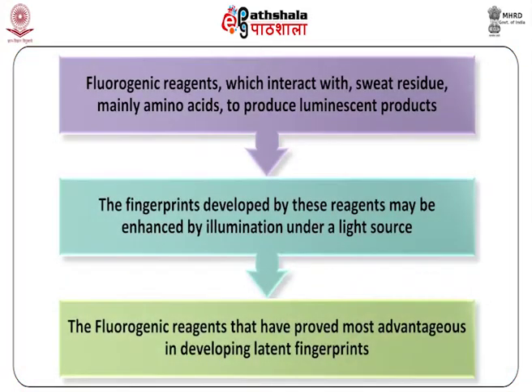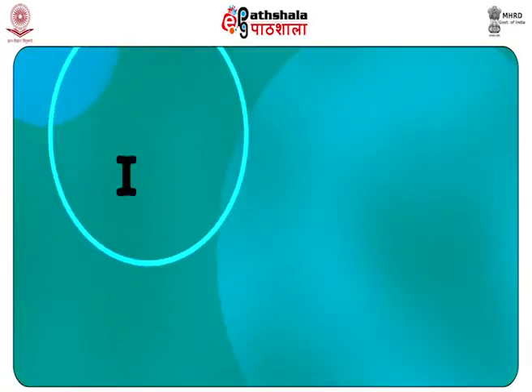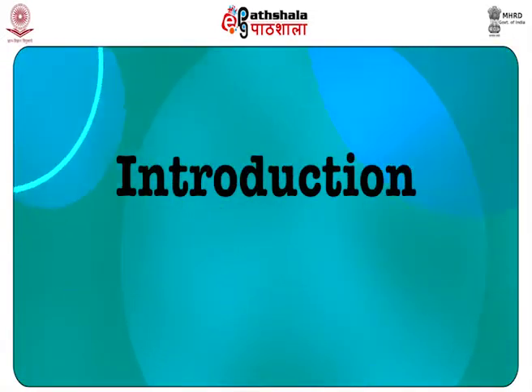Dear students, after learning this module, you shall be able to know about fluorogenic reagents which interact with sweat residue, mainly amino acids, to produce luminescent products. Then you'll learn that the fingerprint developed by these reagents may be enhanced by illumination under a light source. And finally, you'll come to know the fluorogenic reagents that have proved most advantageous in developing latent fingerprints. Now, let us start with the introduction.